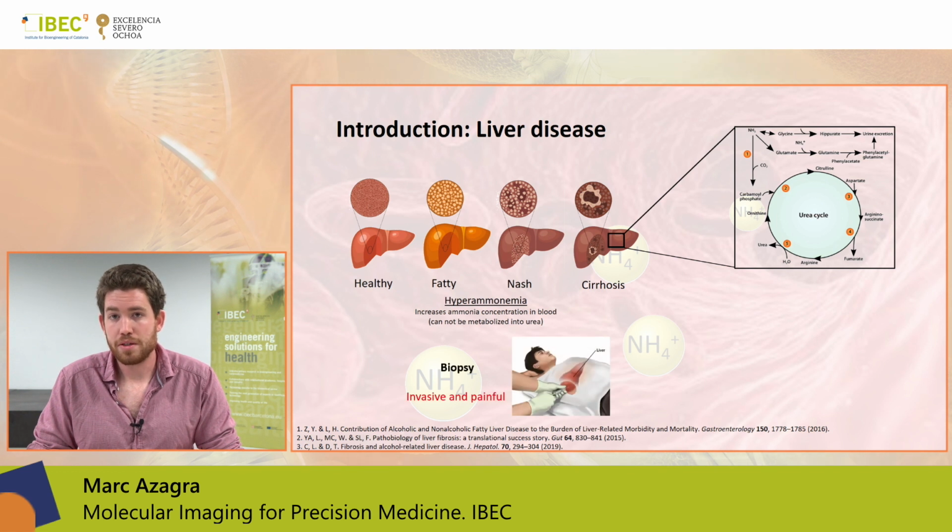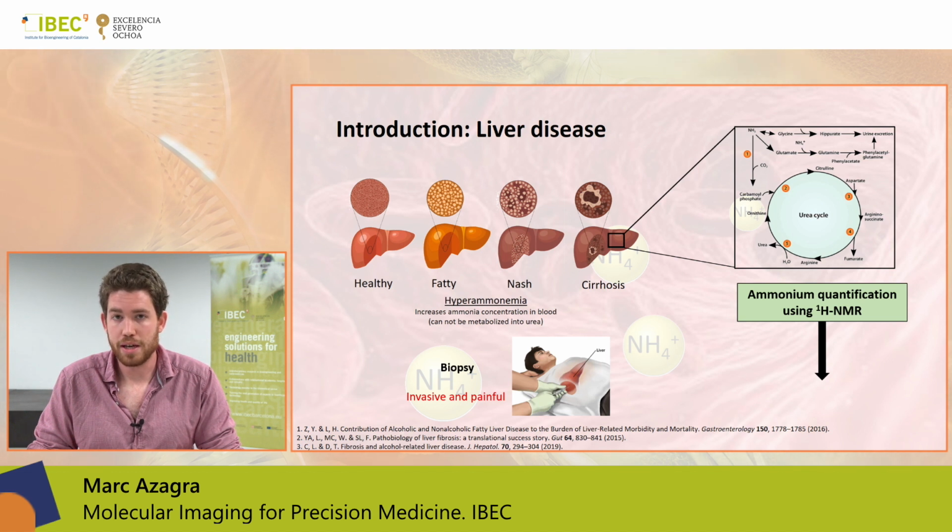So nowadays, biopsy is the only technique for an unequivocal diagnosis of liver disease, but it's invasive and painful. So with this project, ammonium quantification is possible with proton NMR, and therefore the liver disease staging.